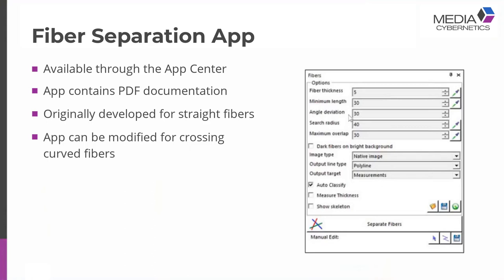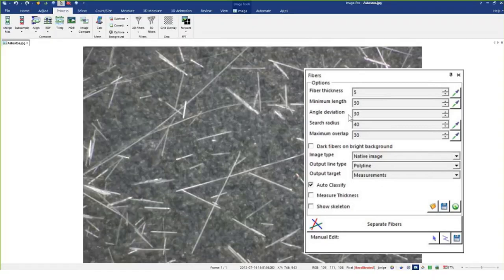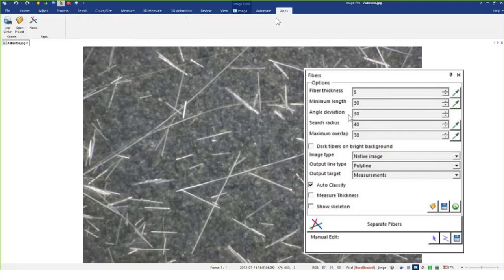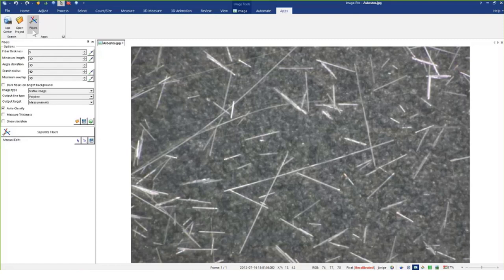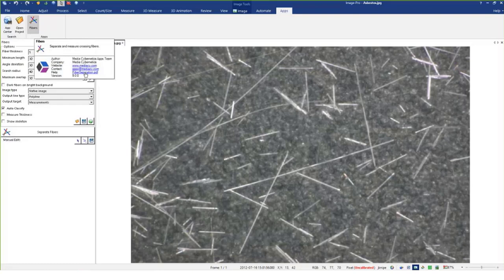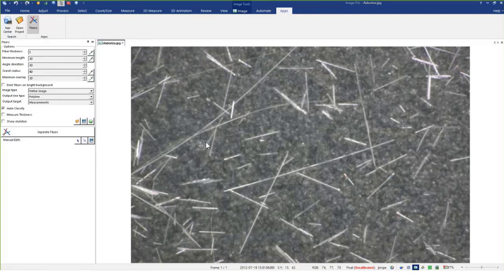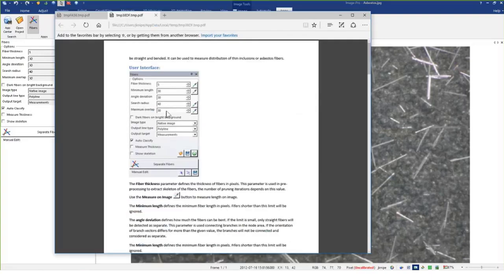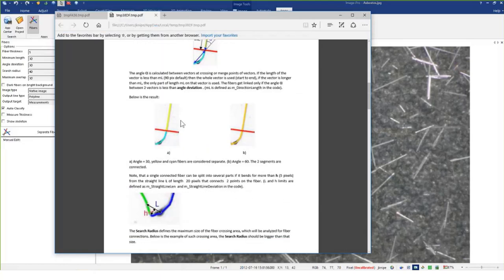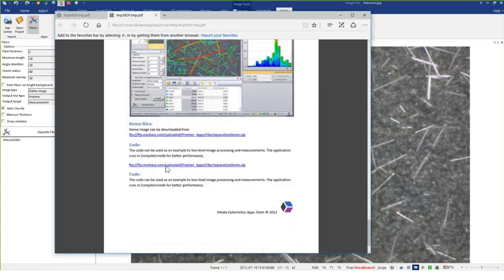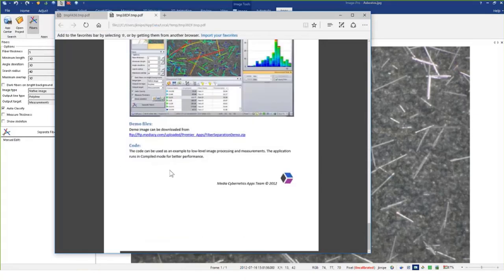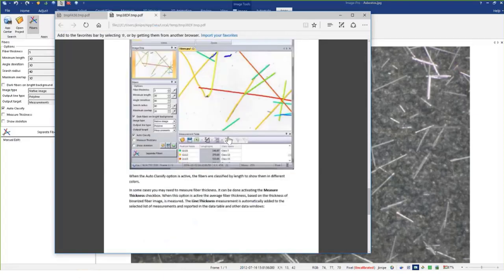Let me go live and call up ImagePro. This is an asbestos fiber — as you can see right off the bat, a lot of texture, a lot of background, sometimes a little hard to distinguish the fibers. Fairly typical example. The app is located in the Apps tab; you can download through the App Center. There's also a PDF accessible by hovering over the app. You can actually download demo fibers from our website as well.